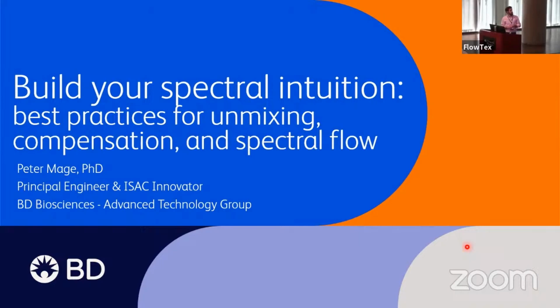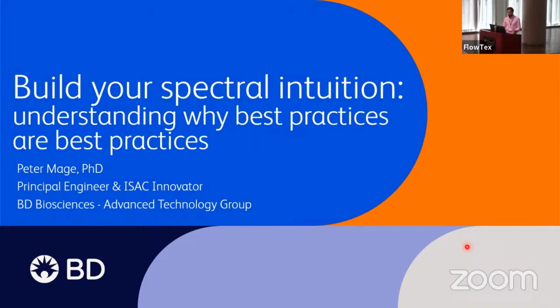My talk is about building your spectral intuition. What I mean there is, when you get invited to give a talk on best practices for unmixing, compensation, and spectral flow, and you don't actually know what those are, you can instead think about what you do know, which is understanding how spectral cytometry works. So really what this talk will be about is not so much what the best practices are.